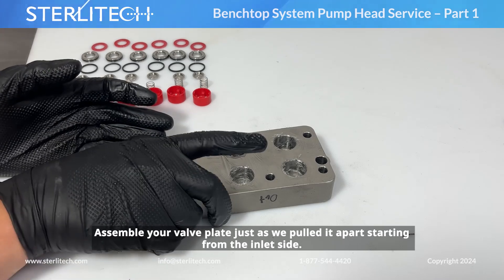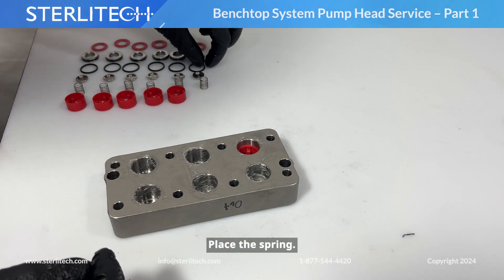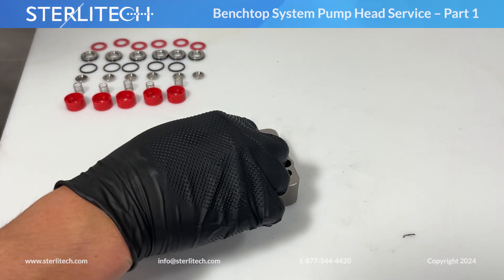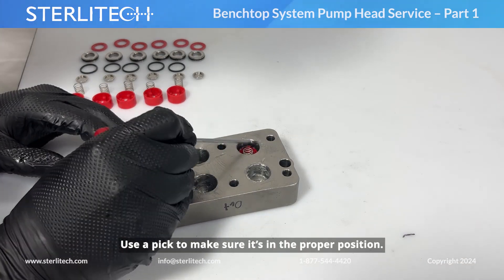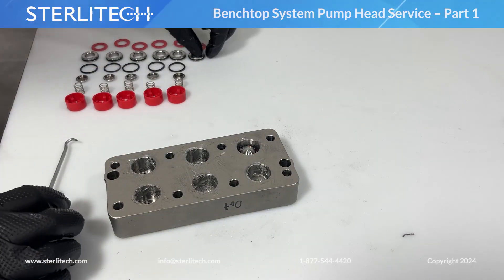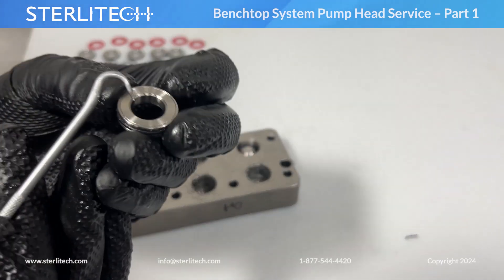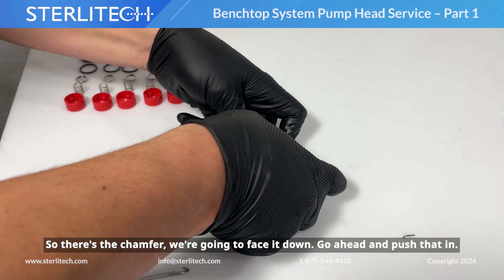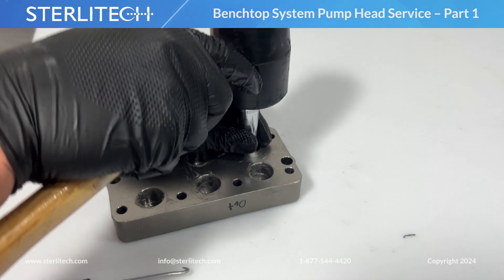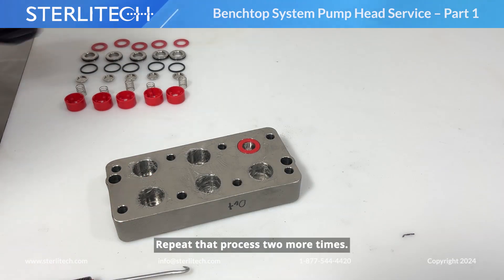Next, assemble your valve plate just as we pulled it apart. Let's start with the inlet side. We'll begin by placing a retaining clip — press it all the way to the bottom. Next, we'll place our spring, then insert the O-ring around the retaining clip, and use our pick to make sure it's in the proper position. Slide our poppet into place. When we insert our valve disc, make sure the side with a chamfer on the inner edge is facing down. Go ahead and push that in — sometimes it helps to use a larger size socket and a mallet to make sure it's fully seated. And finally, the washer on top. Repeat that process two more times.